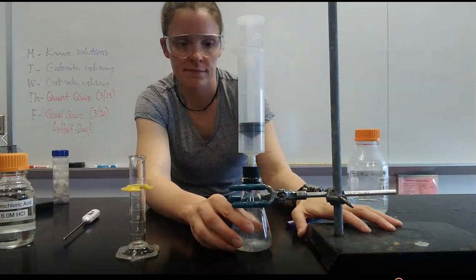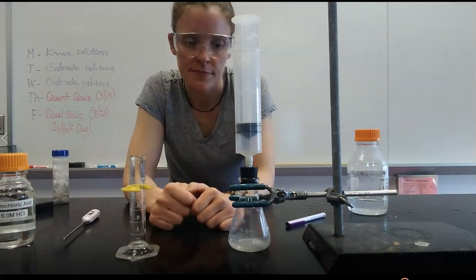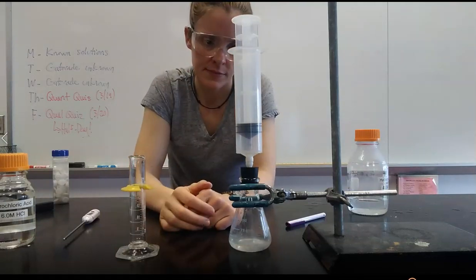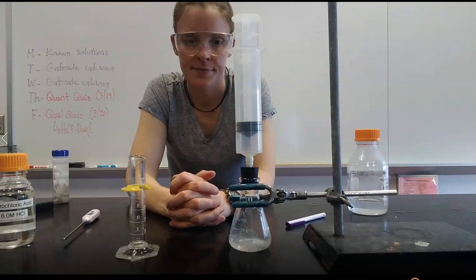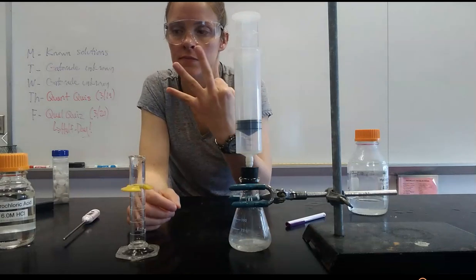You're going to repeat this very experiment a bunch of different times. We're going to do a concentration study. I'm still trying to get it to move. This one's going a little bit on the slow side. You might have to swirl the solution from time to time to get it to go.